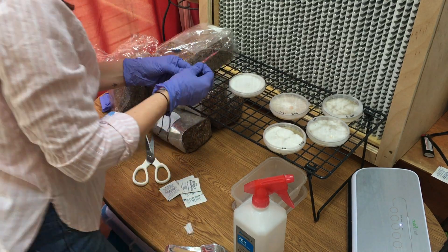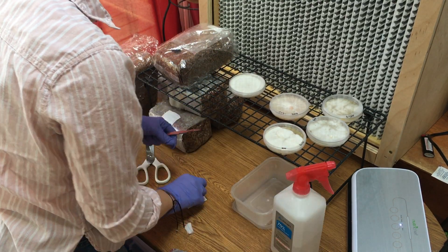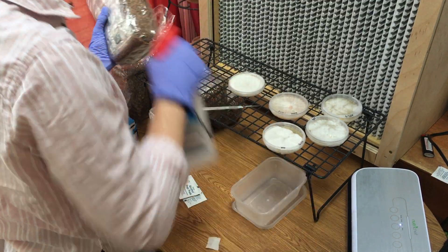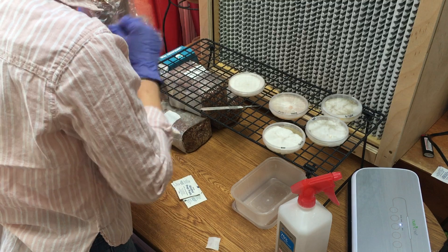Next, I'm going to show you how to transfer agar to a spawn bag. First, I recommend being in front of a laminar flow hood or in a sterile environment. Then, I recommend sanitizing everything.